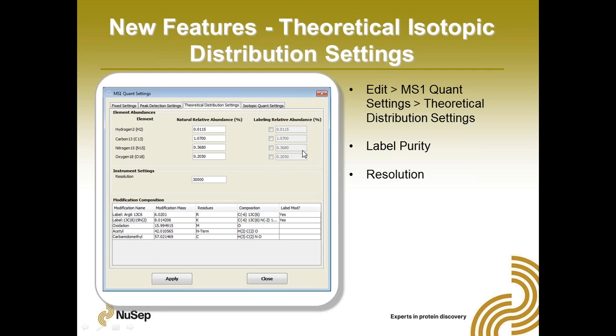This has to do with isotopic label-based quantification. This will allow you to specify reagent impurity. So things like O18, where you can only buy 95% pure H2O18, you can account for that now in the software. Same thing with N15. All right, we'll come back to that setting.